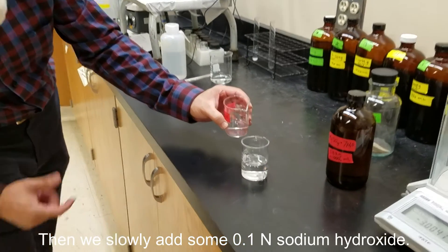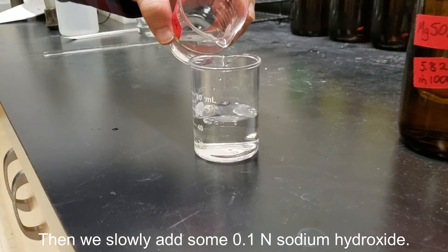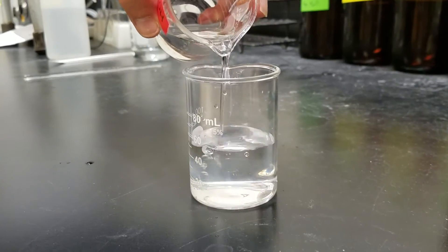Then we start adding sodium hydroxide. The chemical reaction will form magnesium hydroxide.